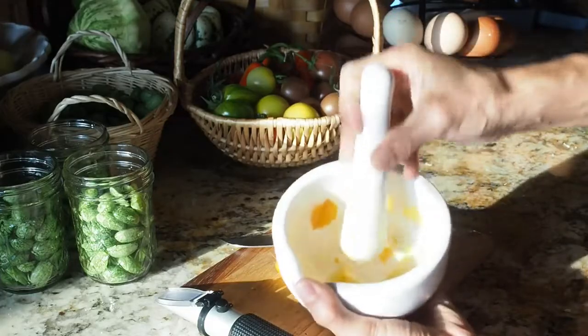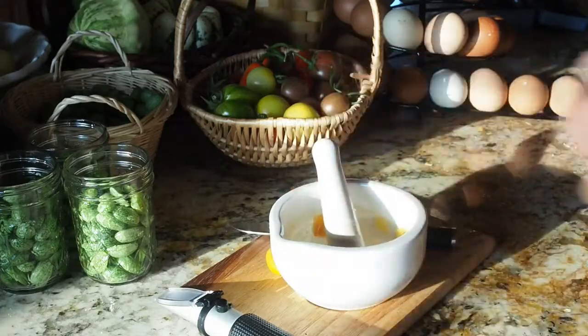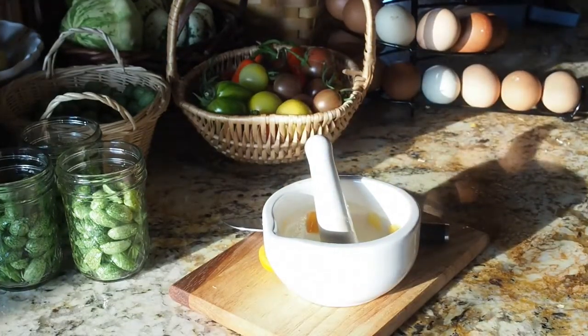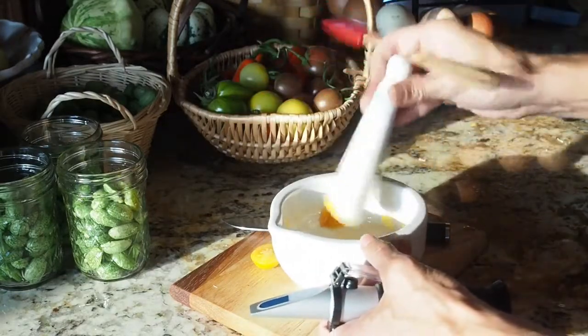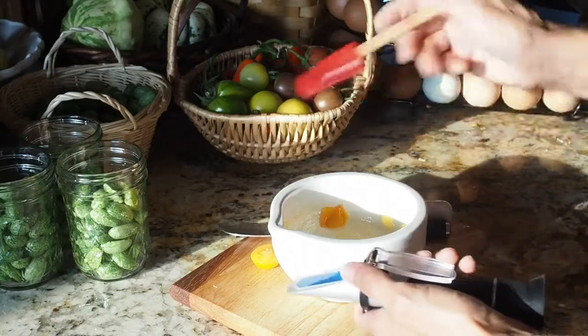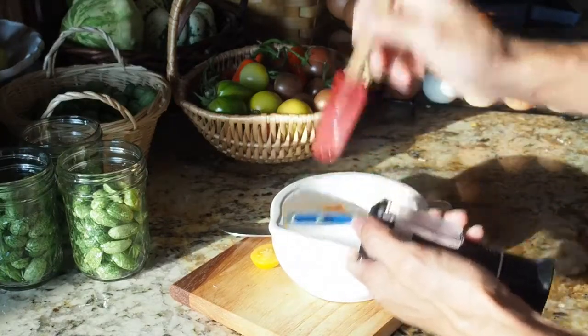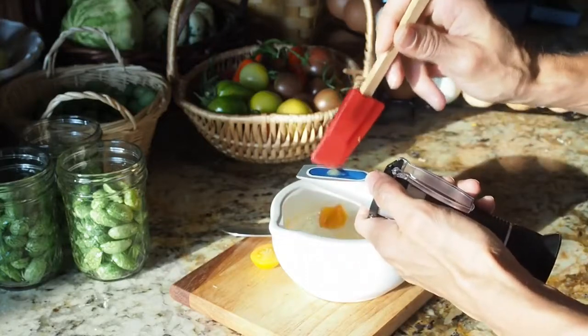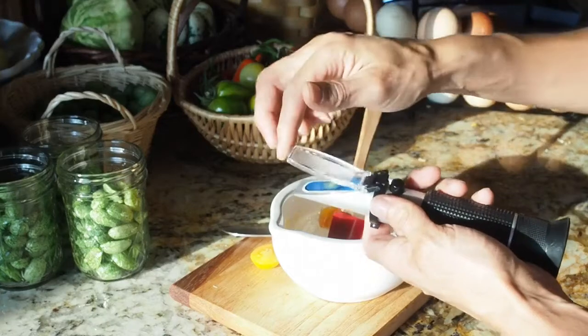I think we have enough juice there to do the test. I'm just going to use a small spatula to try and get a little bit of the juice — you just need a couple drops. And then you flip this down.